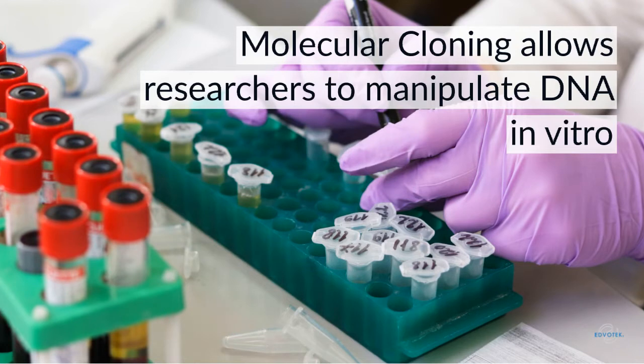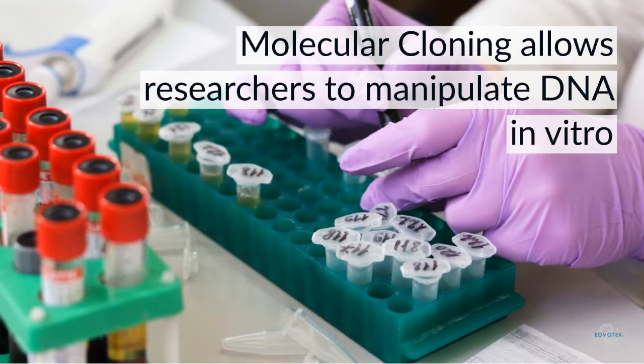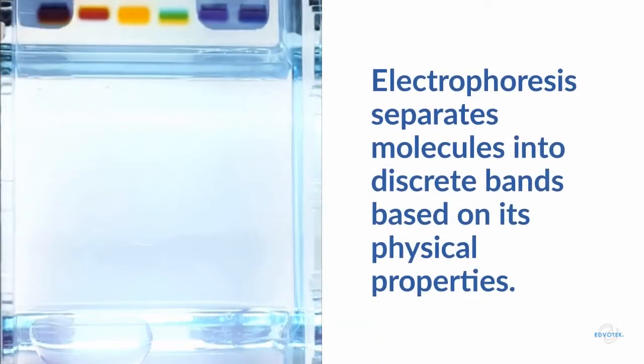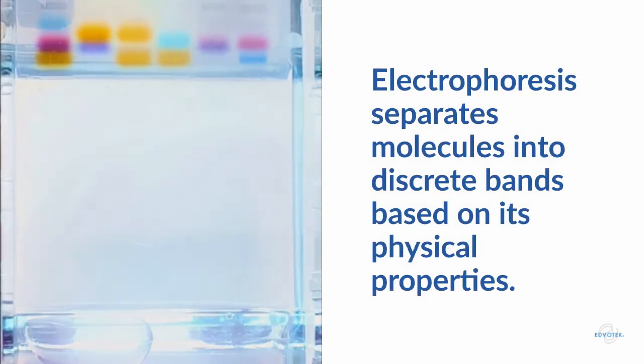Basic techniques like molecular cloning allow researchers to cut, manipulate, and paste DNA to better study it in vitro. Every day, in research labs around the world, scientists use electrophoresis to analyze their DNA of interest.